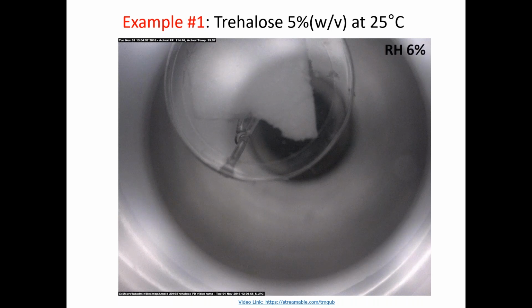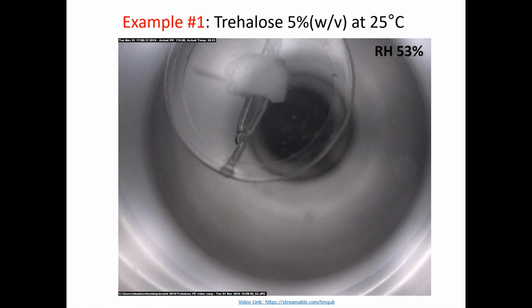And we're just seeing that again. We'll just watch that once more while we're here. And again, that's the piece of cake you can see where I'm tracing with my mouse right there. That's the cake. I take it with a razor, we cut a piece of the freeze-dried cake and put it in there. And it's quite stable. If I put my mouse just there for a moment, you see that. My mouse there, it's stable to about just under 50%, and then it goes.